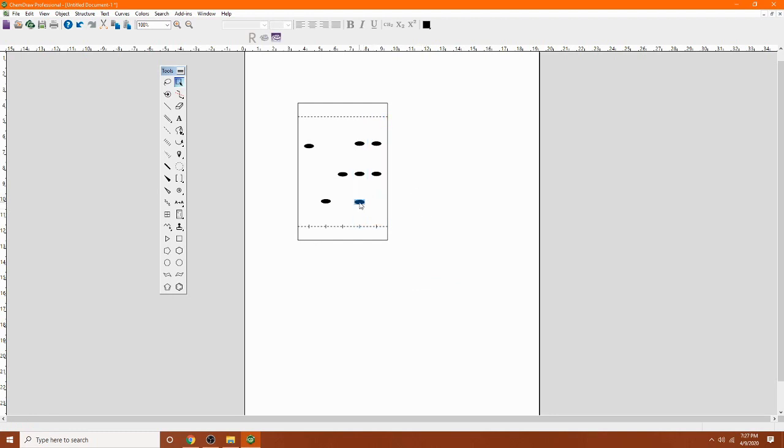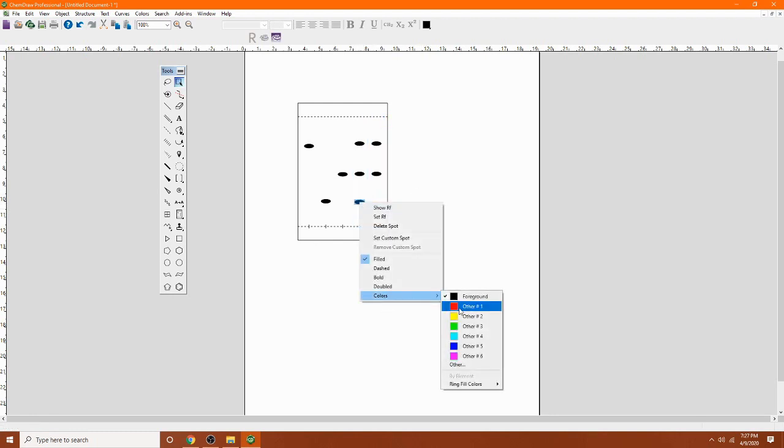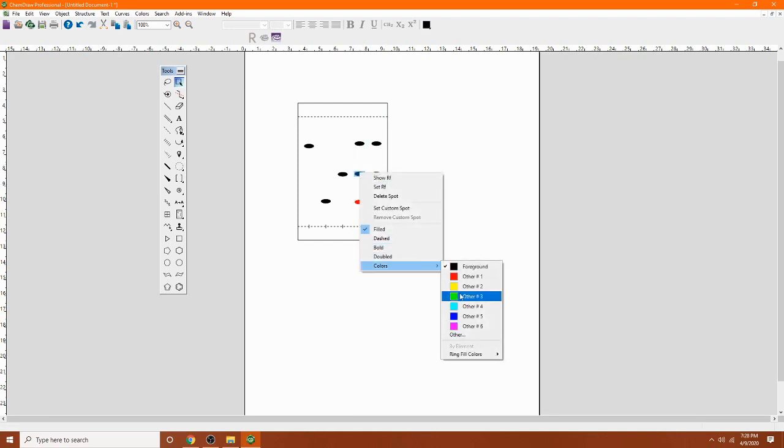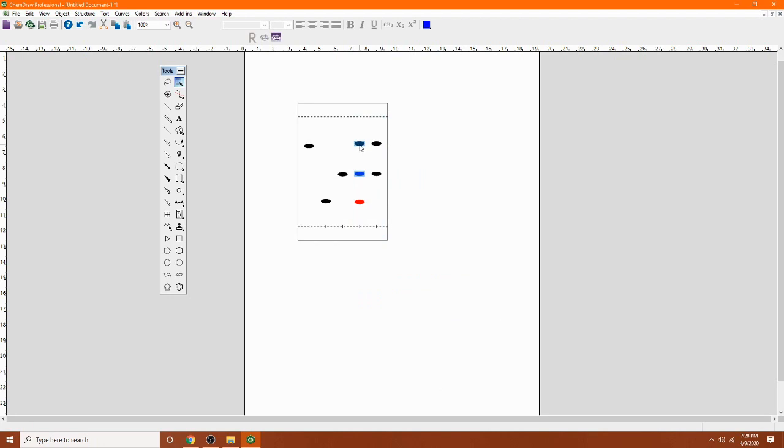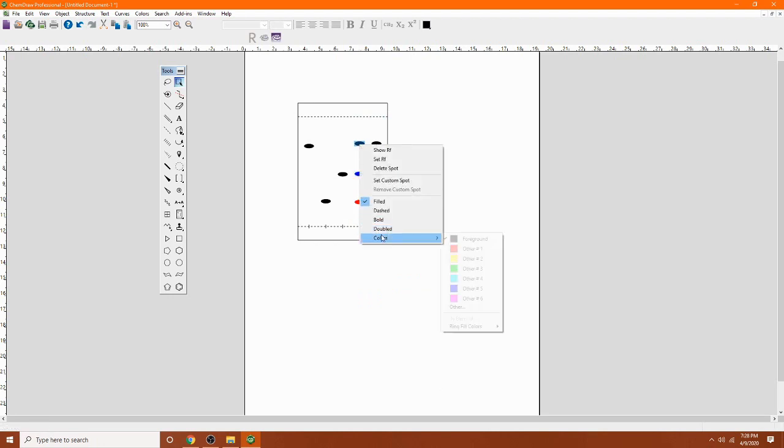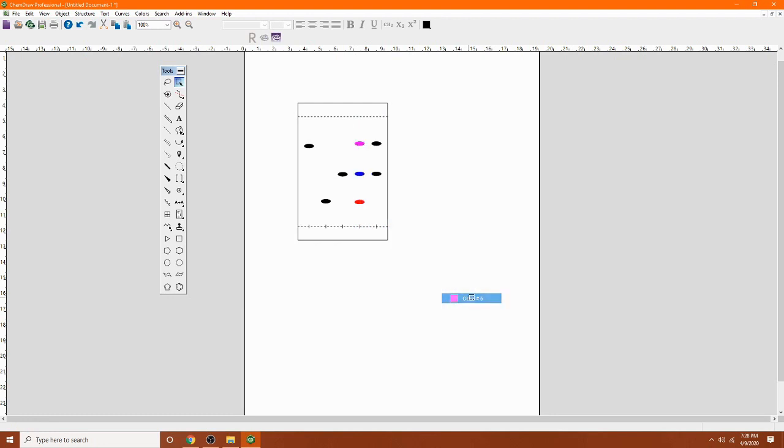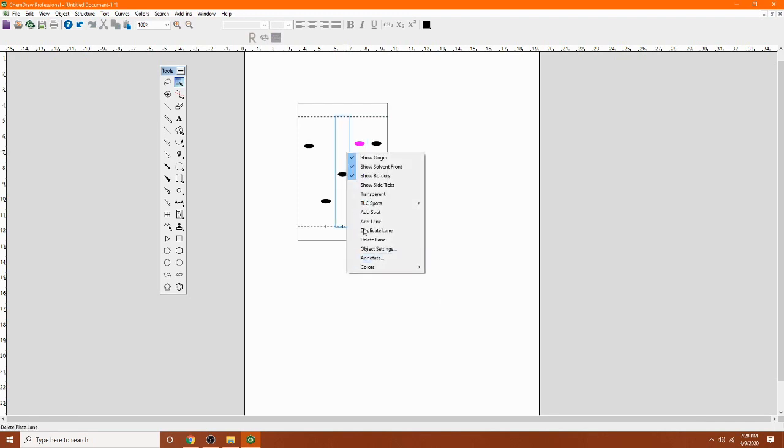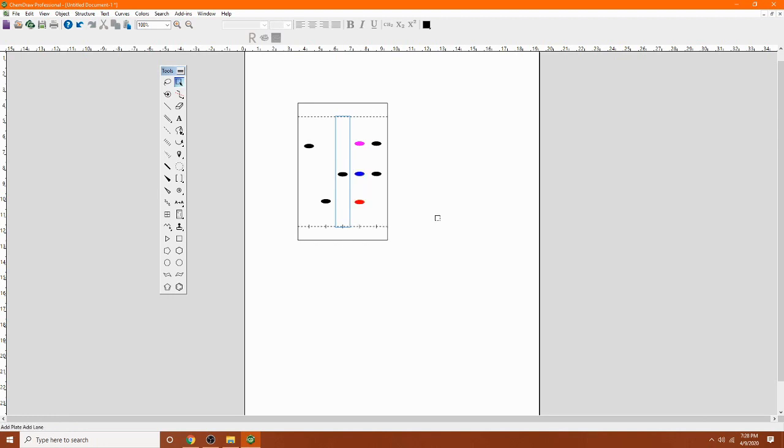And then you can color the spot. So red. I'm going to color it blue. So point to the spot and right click and color. This is going to be pink. So anywhere you want to go, you can put a cursor, right click, you will see all the selection of add lane or add spot. Or delete or duplicate lanes.